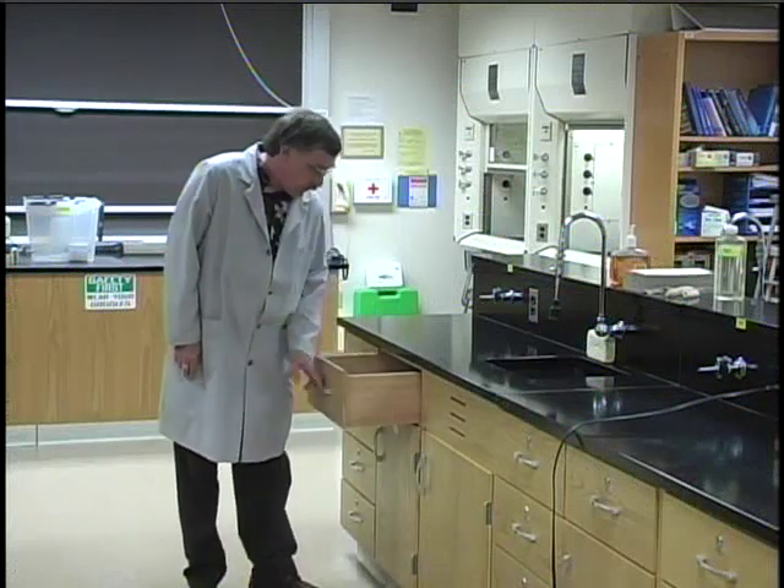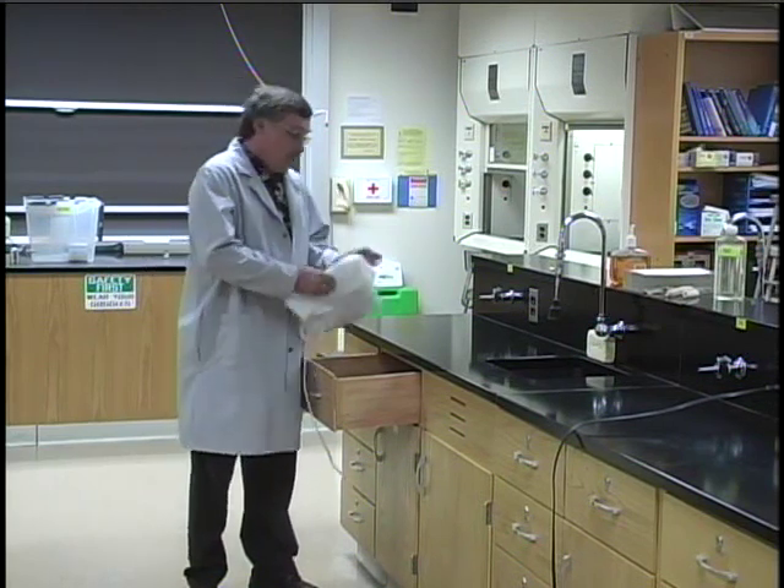The lab aprons are located in the upper right-hand drawer of your lab station. They provide extra protection from chemical spills and reduce the chance that you're going to have to use the safety shower. Some instructors require aprons for all chemical experiments and others make their use optional. Your instructor's policy on lab aprons will be covered under the lab rules section of this video later on. The most important piece of safety equipment in the lab is your own two eyes — you need to be aware of what is going on around you, because if someone is not following proper procedures, you could be injured as a result. If you ever see anything in the lab that makes you uncomfortable, talk to your instructor.